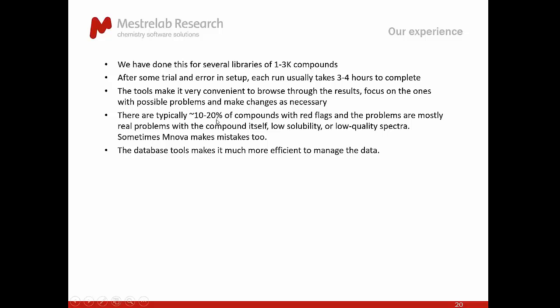There are typically a significant percent of compounds with red flags, and the problems are usually the real problems with the compound itself, low solubility, low quality spectra, and sometimes, of course, Mnova also makes mistakes, but it's easy to look at that and fix that. And of course, the database tools also make it much more efficient to manage the data.